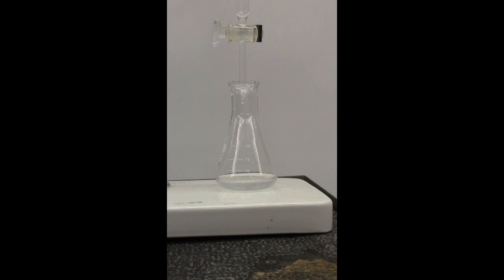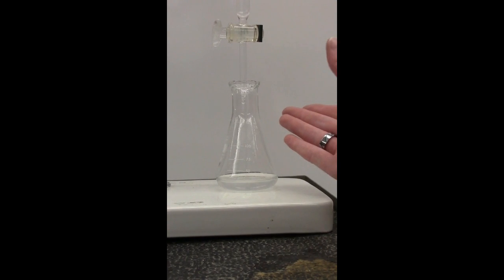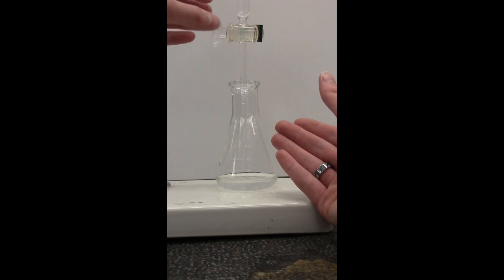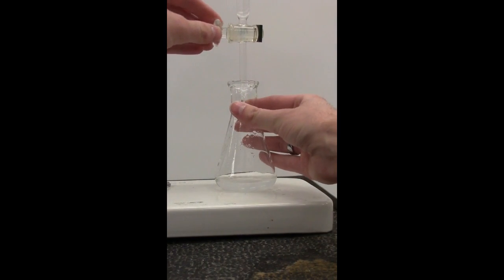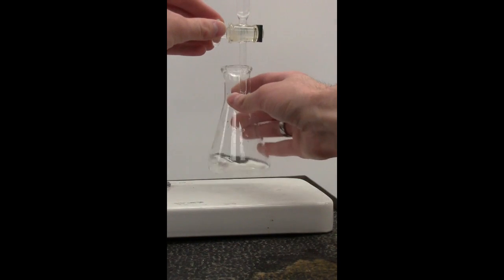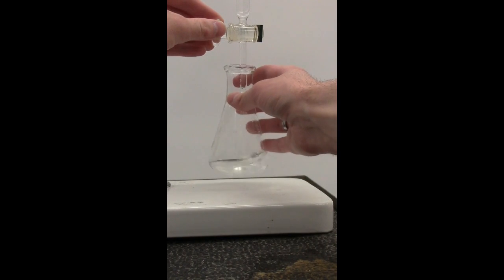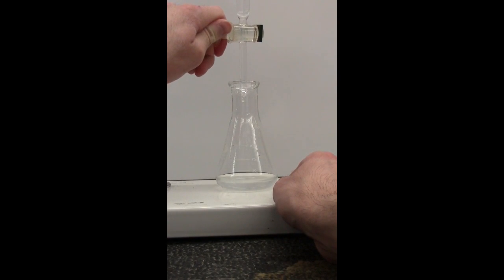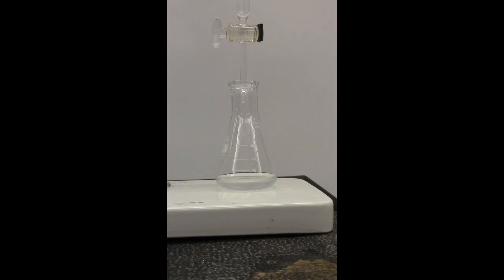The next thing I'm going to teach you is how to properly dispense liquid from the buret. What you're going to want to do is with your dominant hand, which happens to be my right, and with your non-dominant hand, which happens to be my left, grab both the flask and the stopcock. The flask in our right hand, we're going to swirl as the liquid dispenses from the burette. And then we're going to control the speed, or the rate at which the liquid comes out of the burette with my left hand.